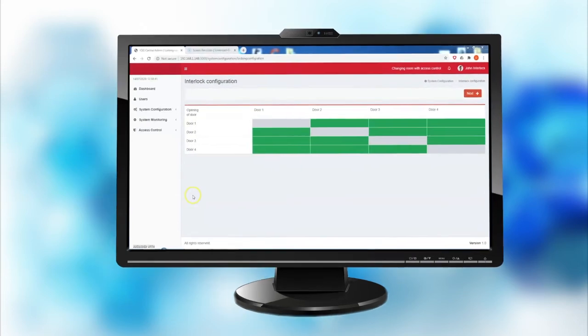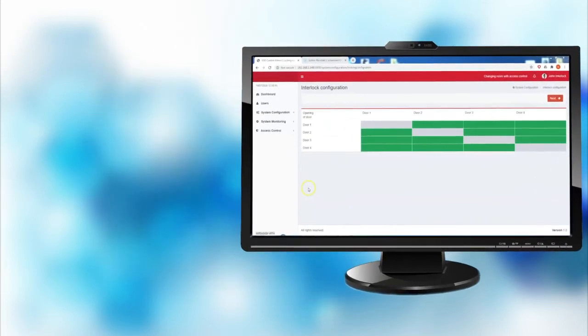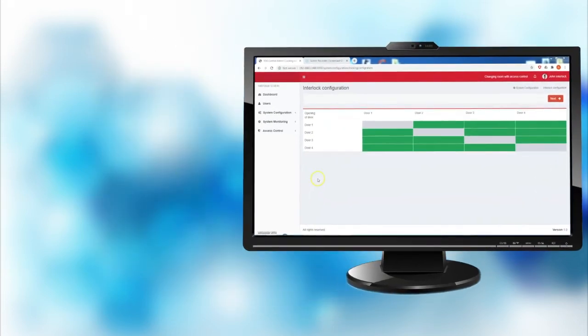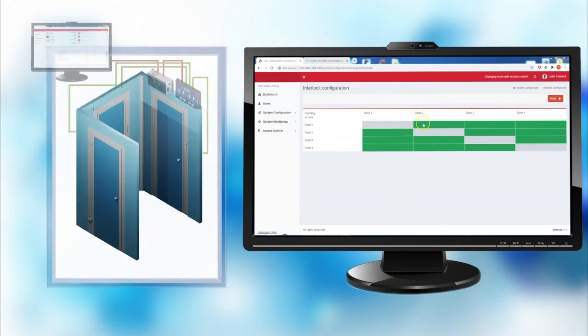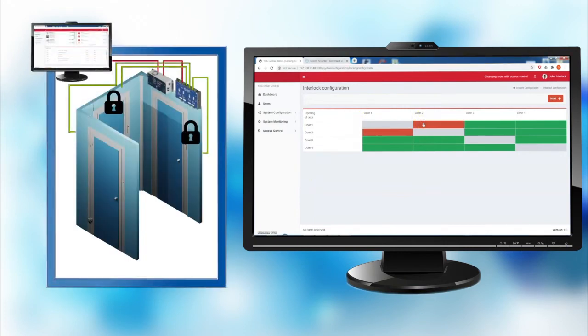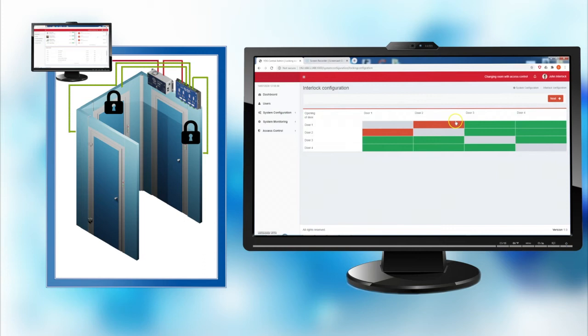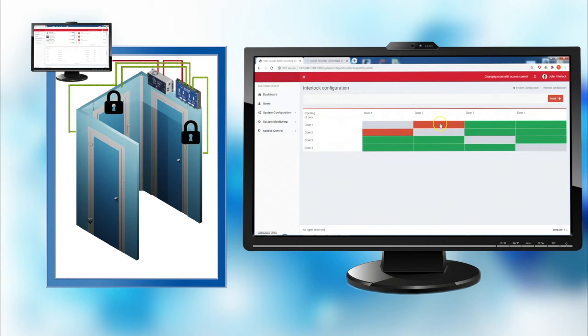During the configuration of a logic, the interlocking relations are defined by an interactive matrix with cells changing color when clicking on them. When a green cell turns red, that means two doors are interlocked between them. When a matrix is defined, it is loaded into the door control nodes and the new logic is automatically saved to the pre-configured logics library.